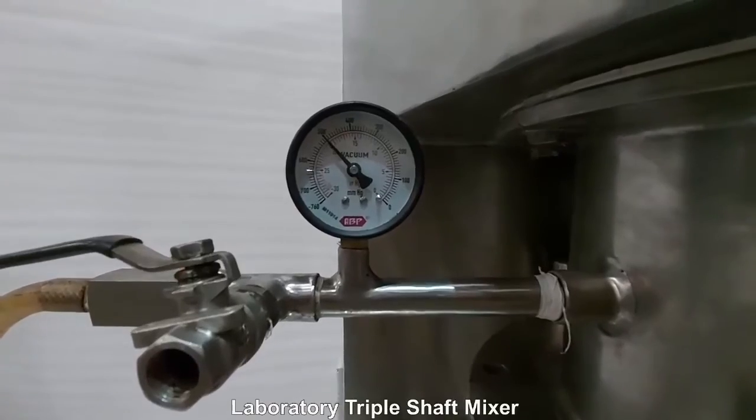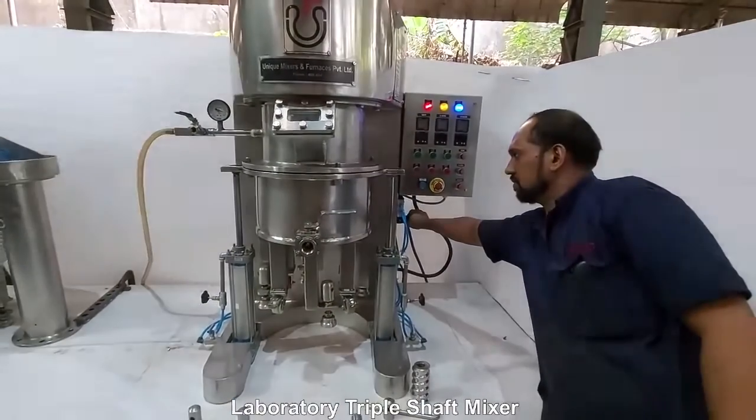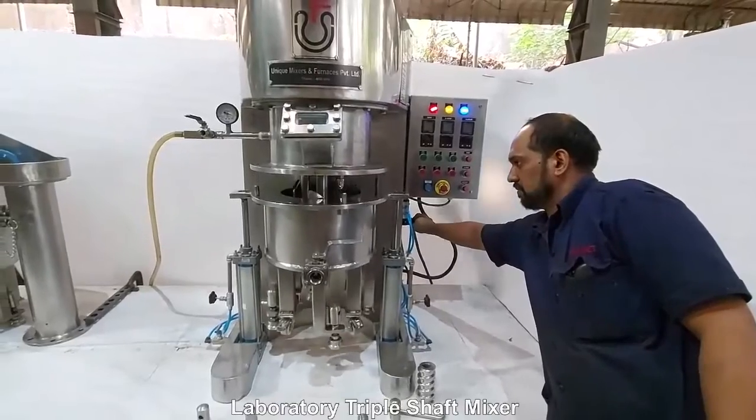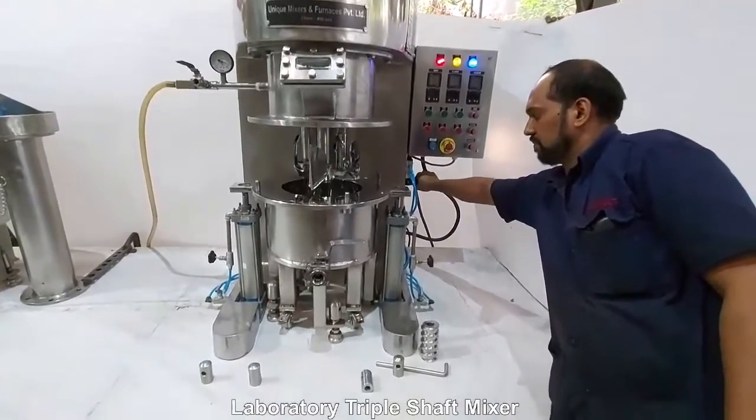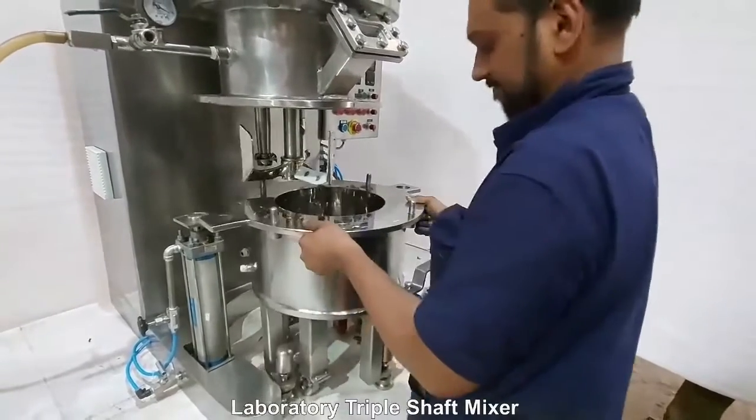With the change can design, the bowl can be easily removed from position and taken to a hydraulic discharge ram if the material is viscous, or there could be a bottom discharge valve.